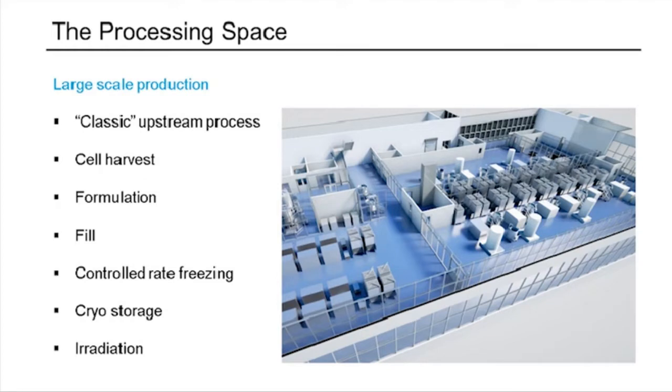And then this would be followed by a formulation step where you are potentially formulating into a cryopreservant buffer so that you can do long-term storage, because again, for an allogeneic product where you are having large bulk processing, it's advantageous to be able to store so that that product can be made in advance and available upon need.